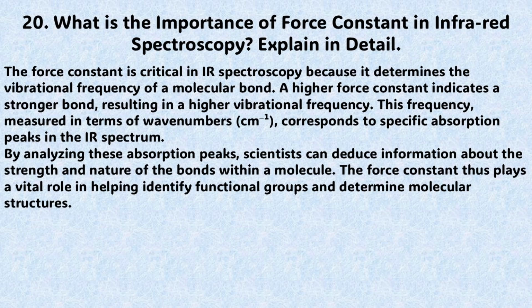The next question is question number 20. What is the importance of force constant in infrared spectroscopy? Explain in detail. The answer to this question is very simple. The force constant is critical in infrared spectroscopy because it determines the vibrational frequency of a molecular bond. A higher force constant indicates a stronger bond, resulting in a higher vibrational frequency.